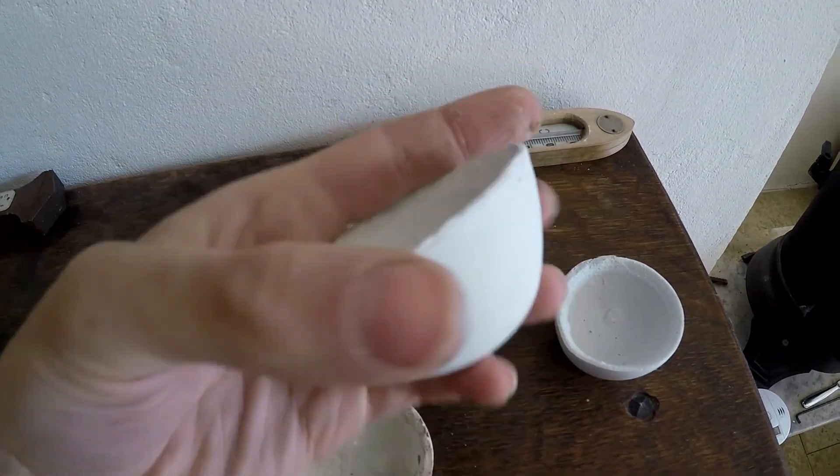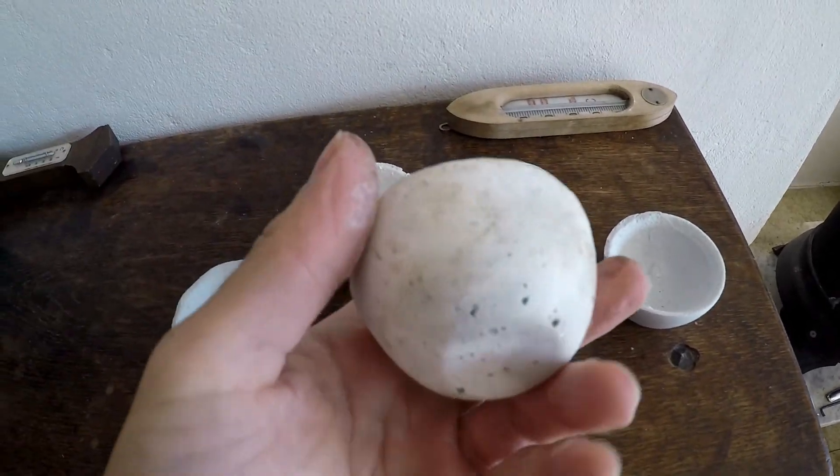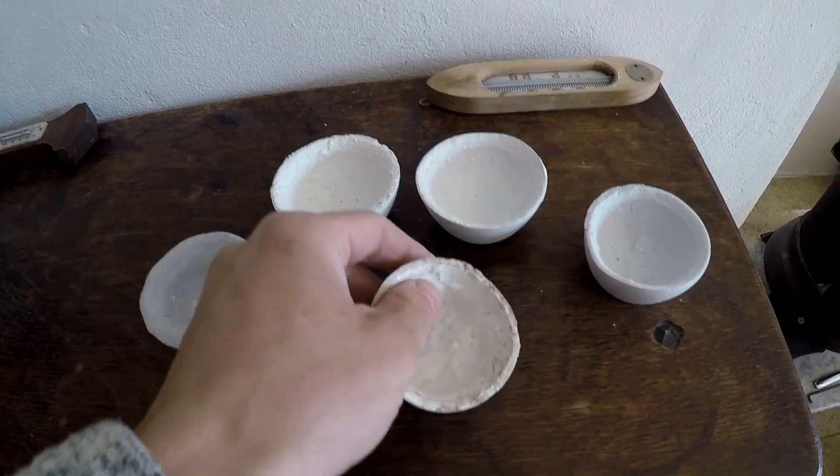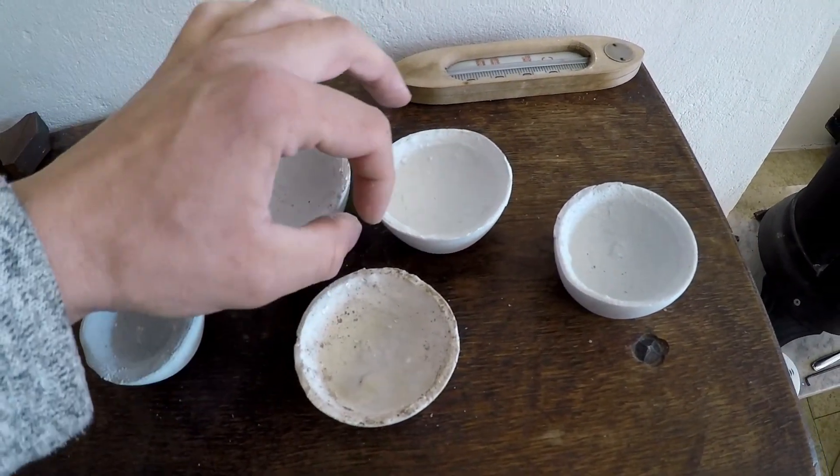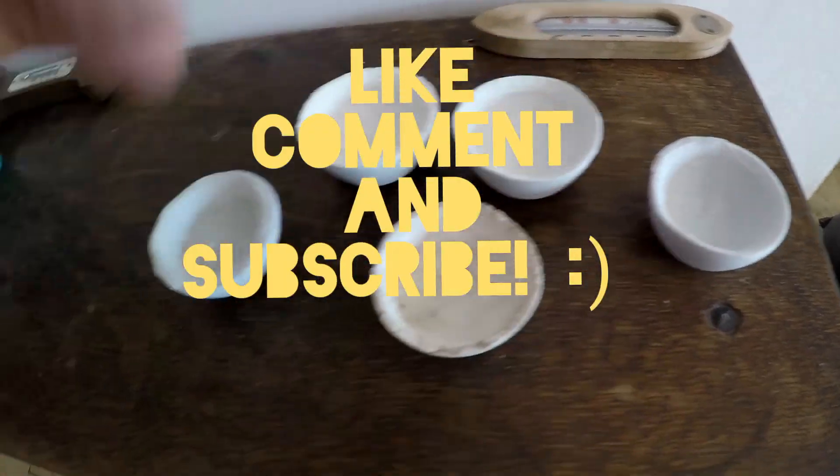The crucible in the middle was fired a couple days ago, and judging by the sound the others make compared to it, they're all dry. Now it's time to fire them and test their refractory properties.